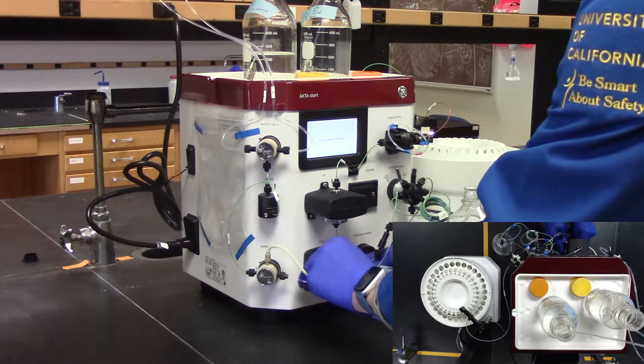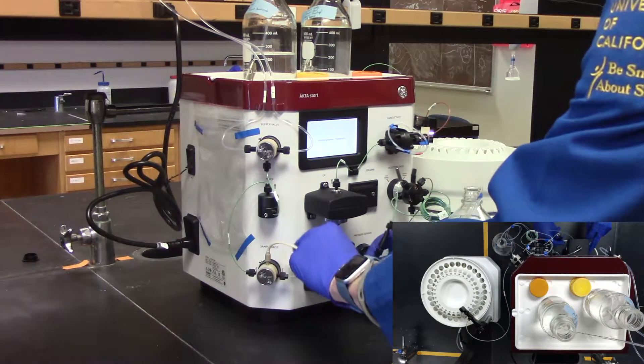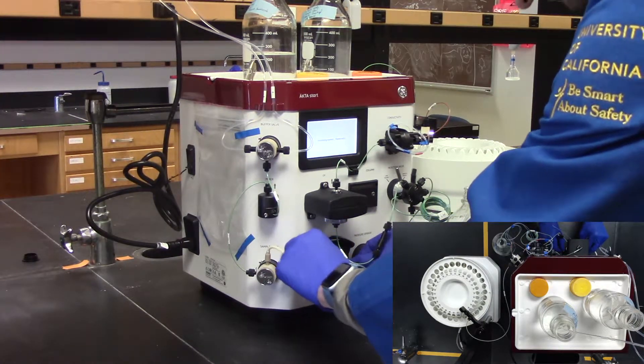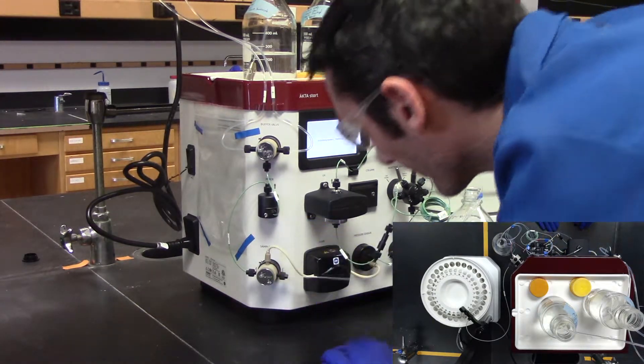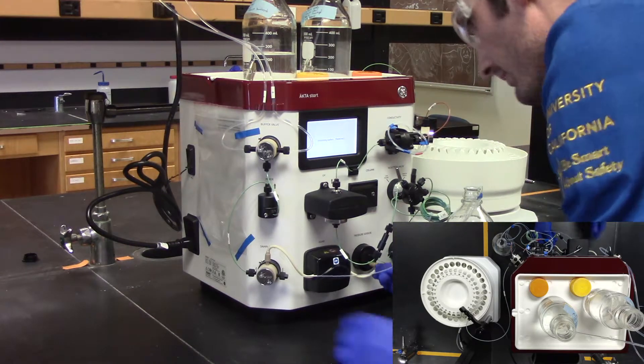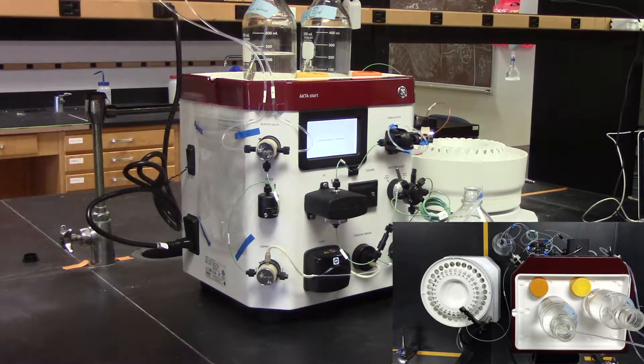Next, we need to insert the line into the peristaltic pump. Open up the clamp of the peristaltic pump and insert the line. Place the line perfectly centered on the peristaltic pump and clamp it shut. Be sure the line is not being pulled from the sample valve or the pressure sensor.